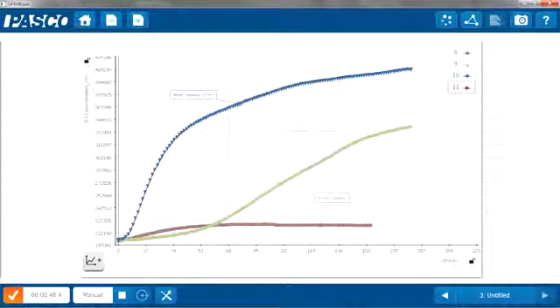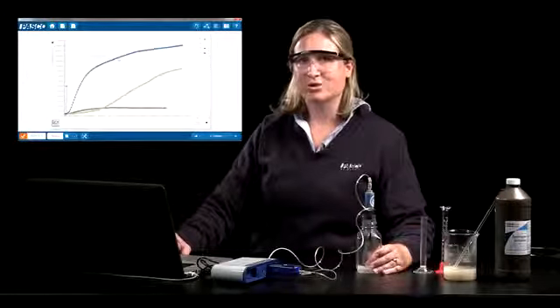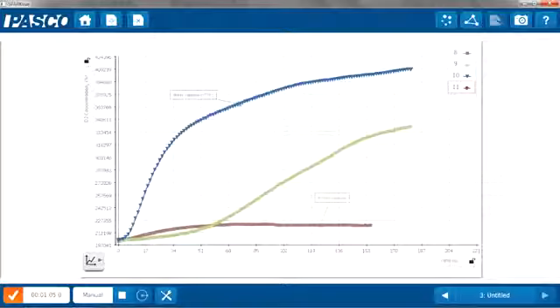And I compared room temperature catalase at about 24 degrees Celsius in green here to warm catalase at 37 degrees Celsius. So students can do this comparison to see how is the enzyme activity different at their body temperature compared to room temperature. There's also data here for boiled catalase, so they can also get evidence of the denaturing of enzymes at extremely high temperatures.